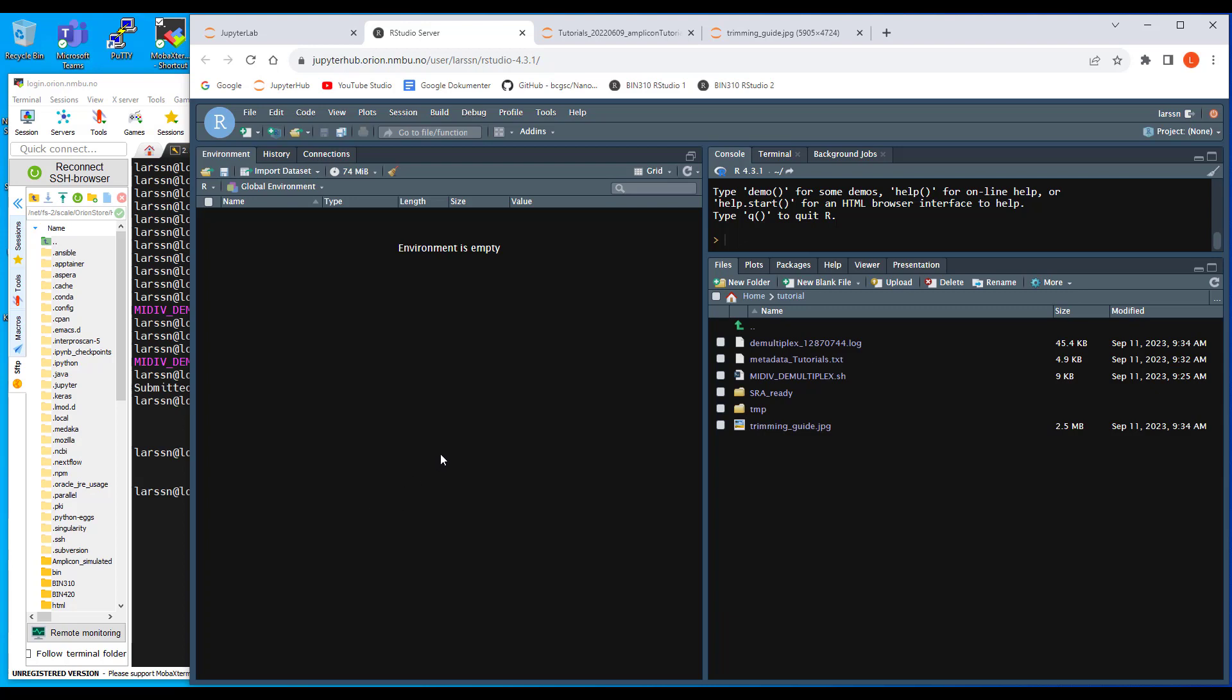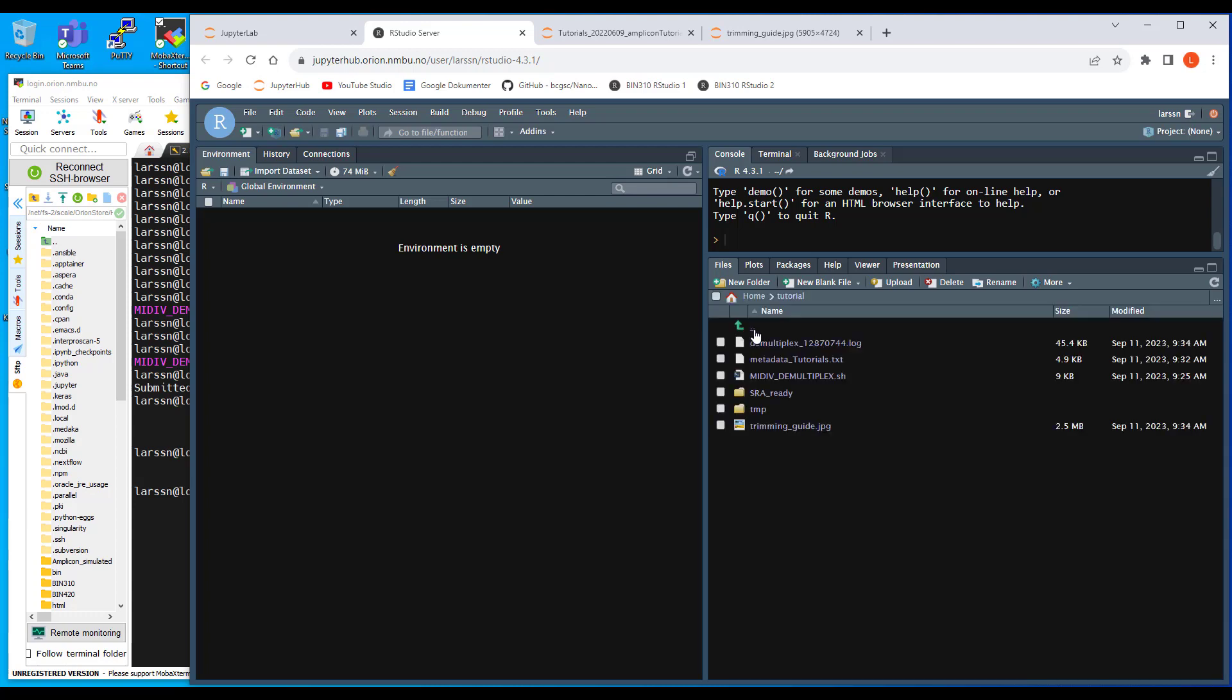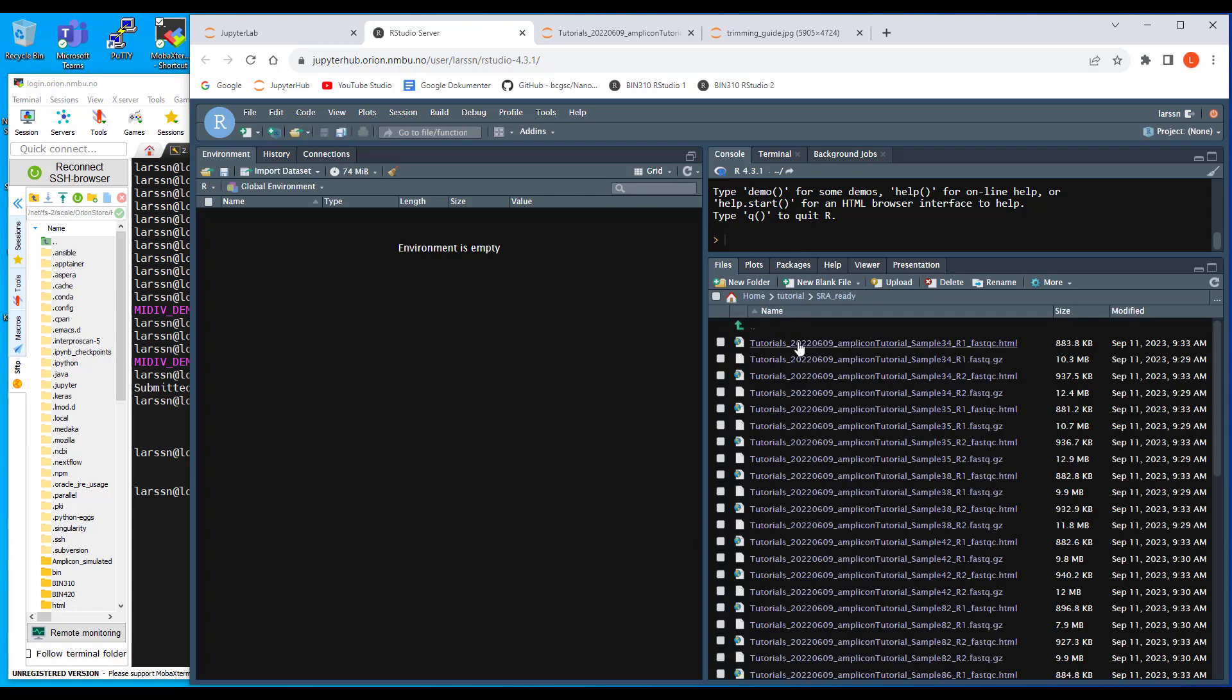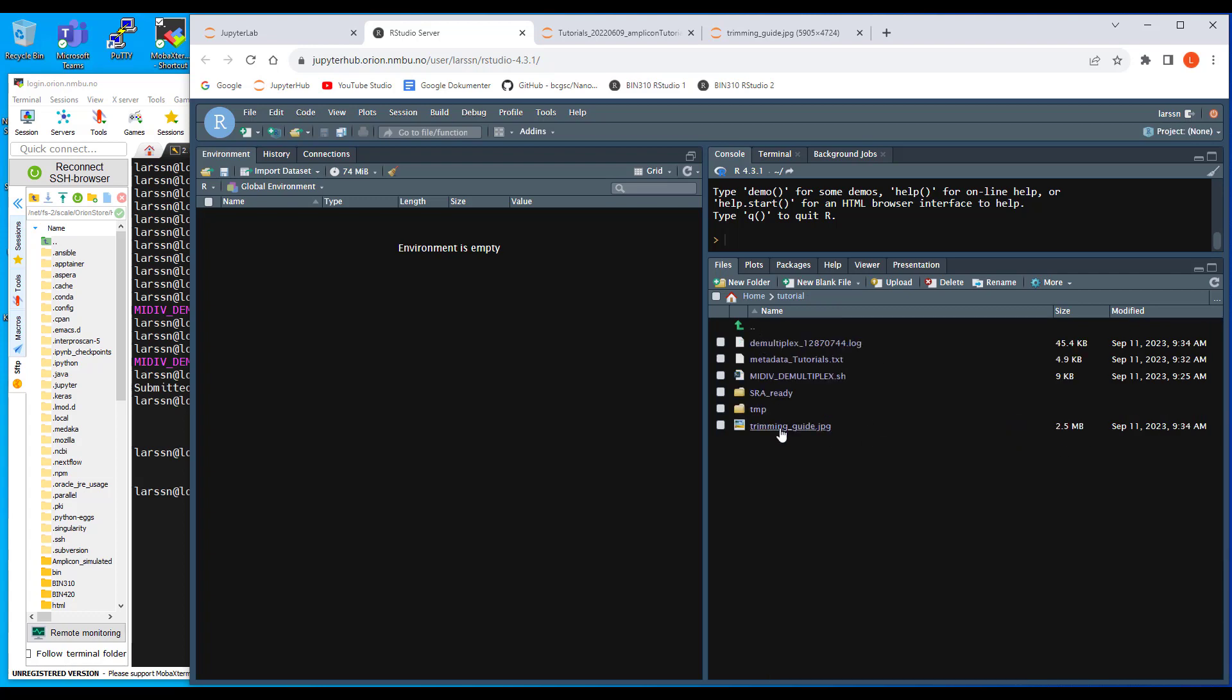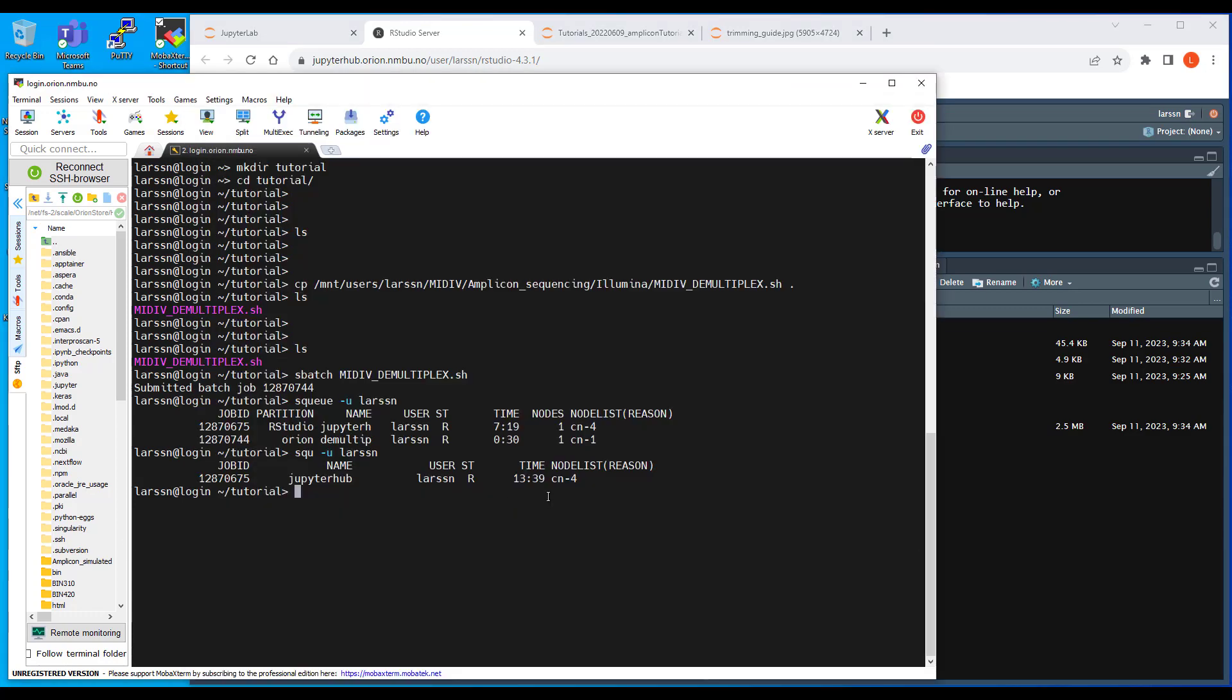The vsearch pipeline. So now we have done some demultiplexing and we have some fastq files here in demultiplexed fastq, one file for each sample. You can see the sample name is in the file name here. Let's see how we use the vsearch pipeline to process this.